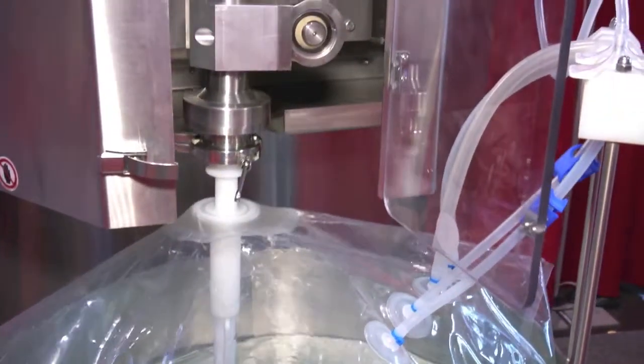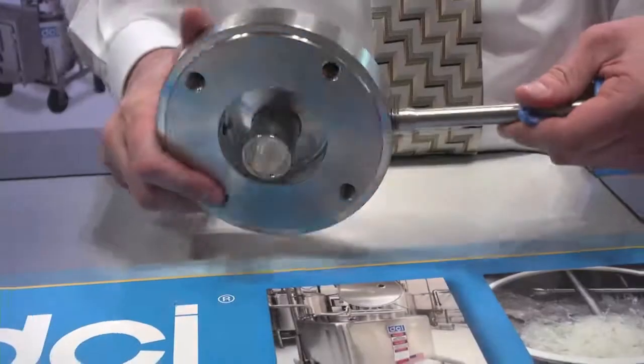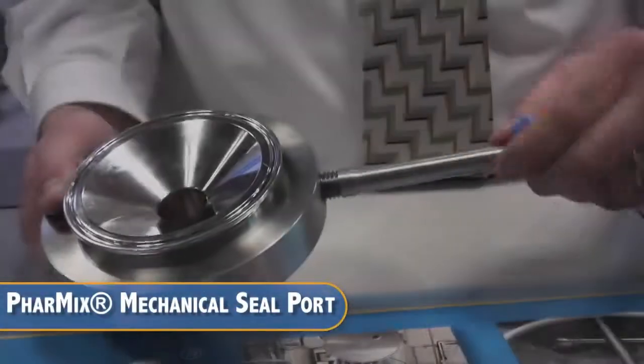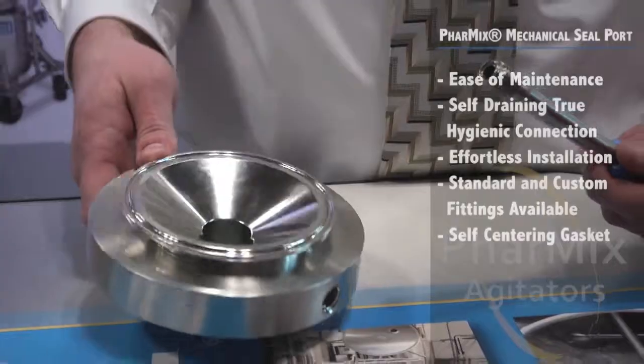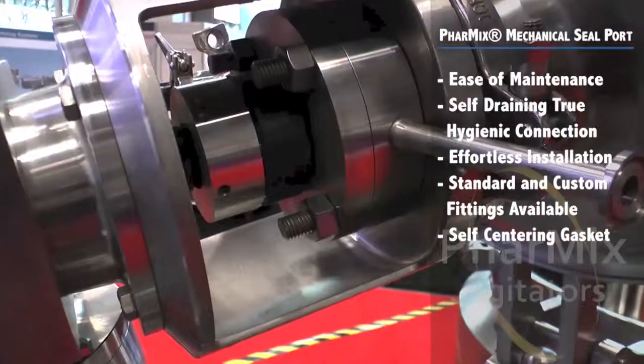Our top-entering models include two unique patent-pending features. The Farmix mechanical seal port eliminates welded sanitary fittings or pipe threads on seals. It makes maintenance and assembly effortless as the seal doesn't have a protruding fitting. The flush interior creates a smooth profile for easy self-draining and a true hygienic connection.